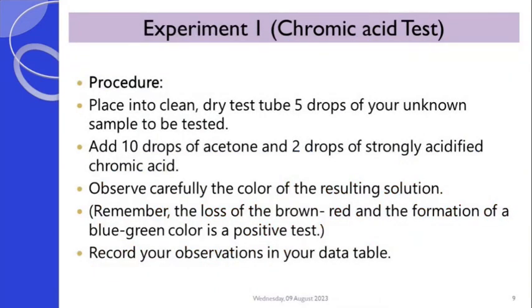Now, the procedure for undergoing this test is explained as follows. You place your sample that is to be tested in a selected dry test tube. For your sample, you can place 5 drops in the test tube or measure 1 ml of the sample.